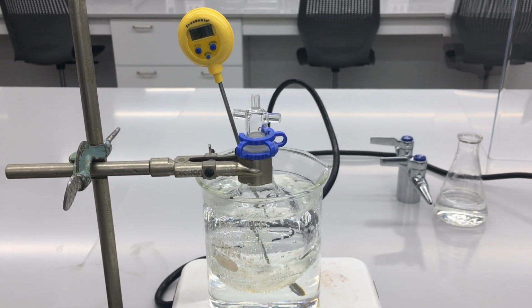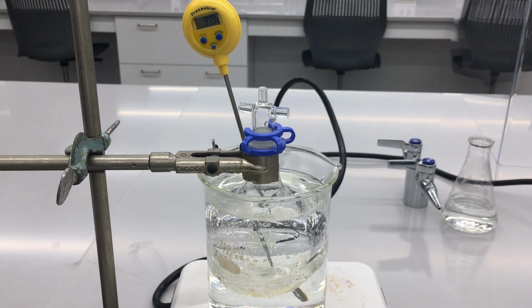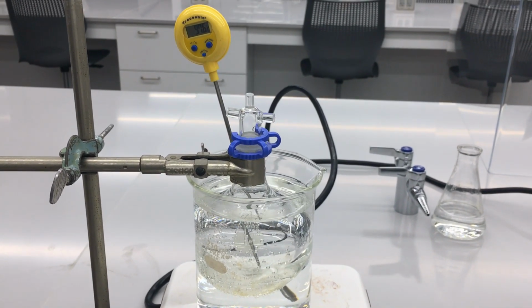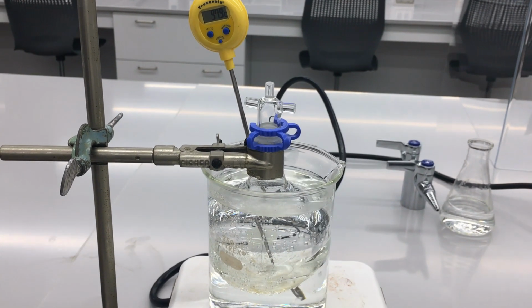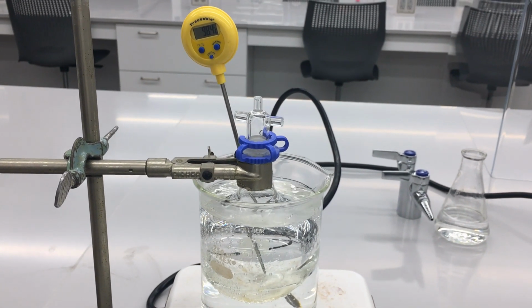All right, we see that the temperature has risen up to 98.7 degrees. So getting very close to that 100 degrees boiling temperature of water.